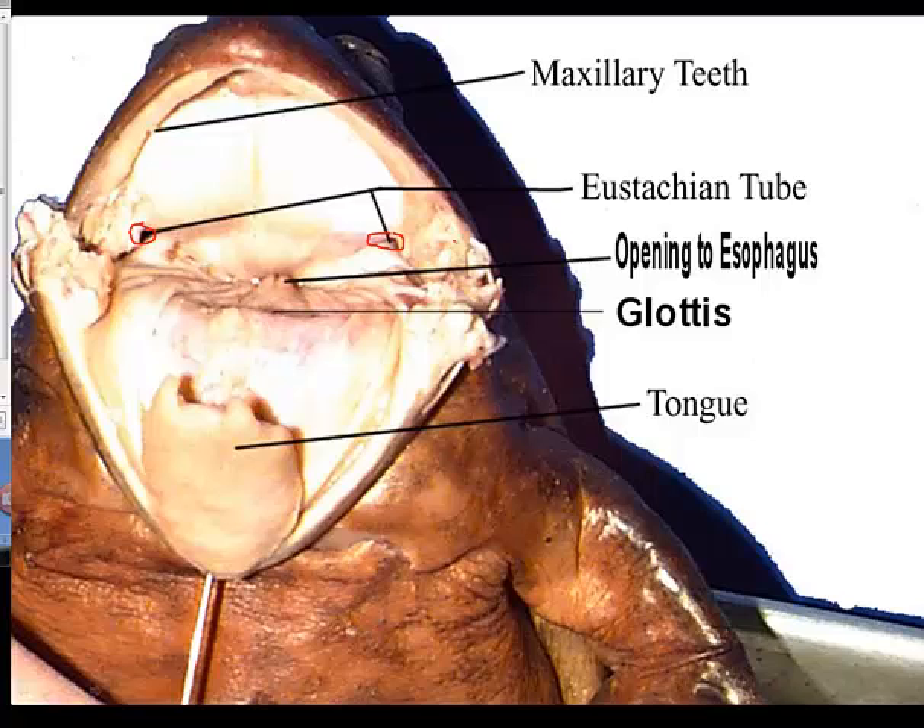The next thing we're going to look at is the maxillary teeth. The maxillary teeth run along the inside part of the jaw right up here. You're not going to be able to see them very well, but you will be able to feel them. We can see the openings for the internal nares, and right along the internal nares — maybe just slightly behind them — are going to be two other teeth on the roof of the mouth called the vomerine teeth. V-O-M-E-R-I-N-E — the vomerine teeth.